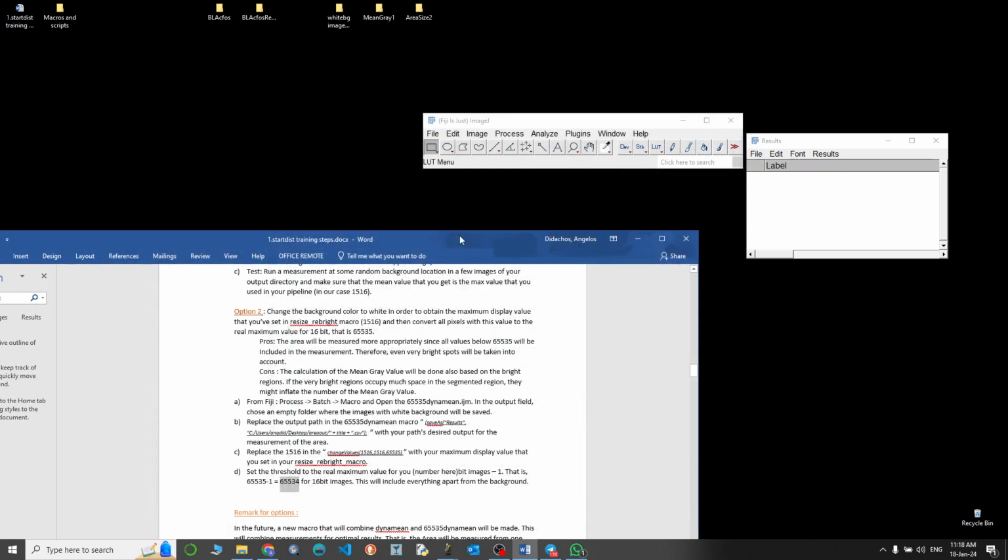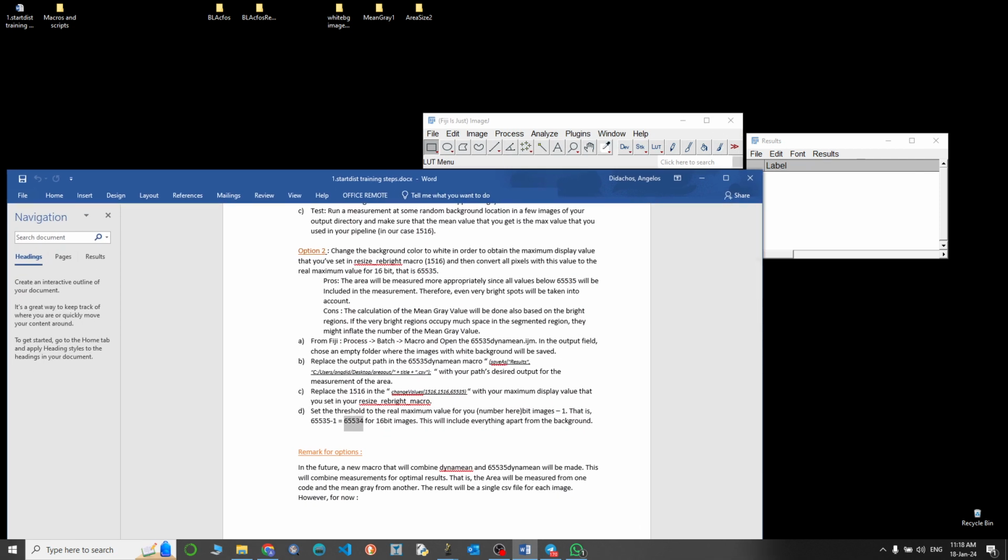Nice, we've completed step 13 and now we're going to move forward.